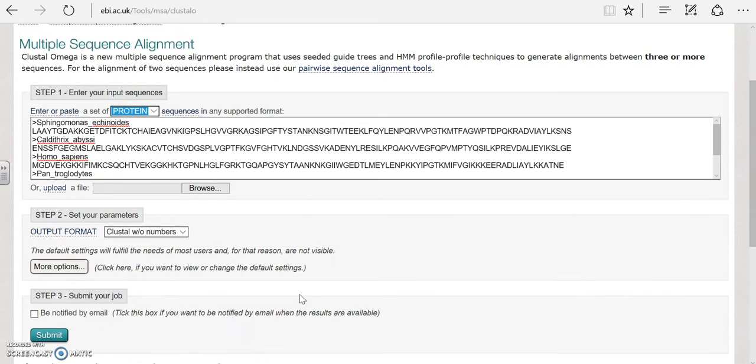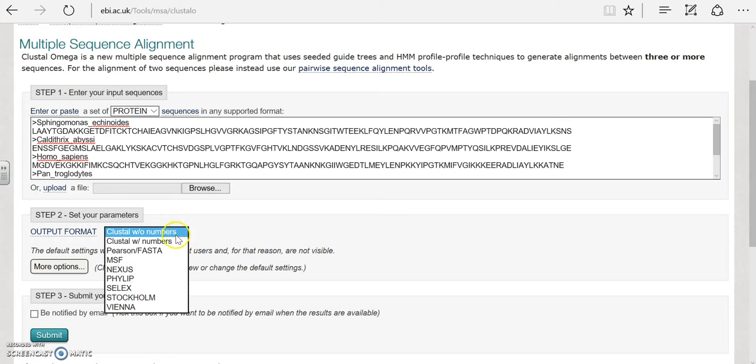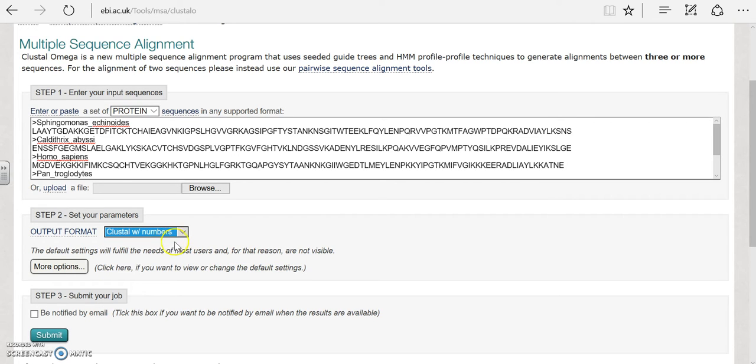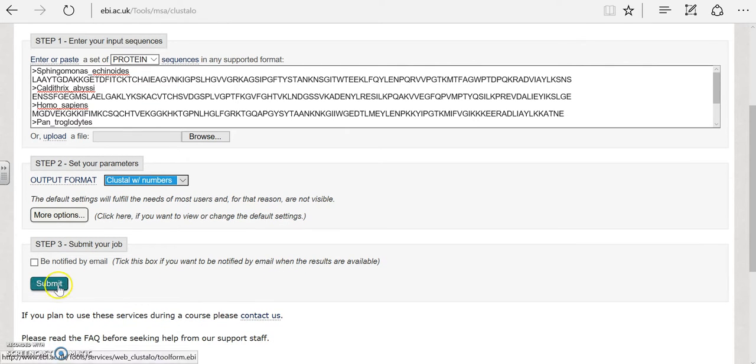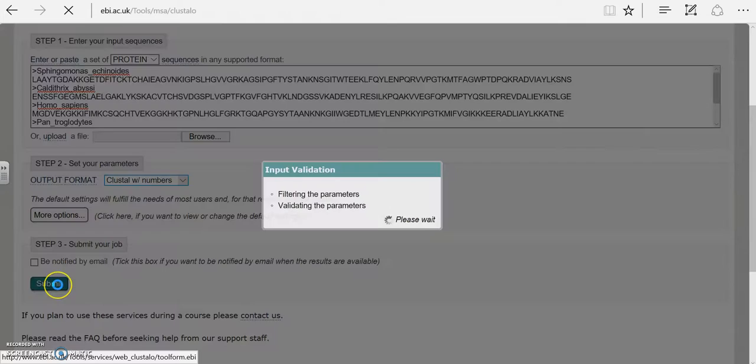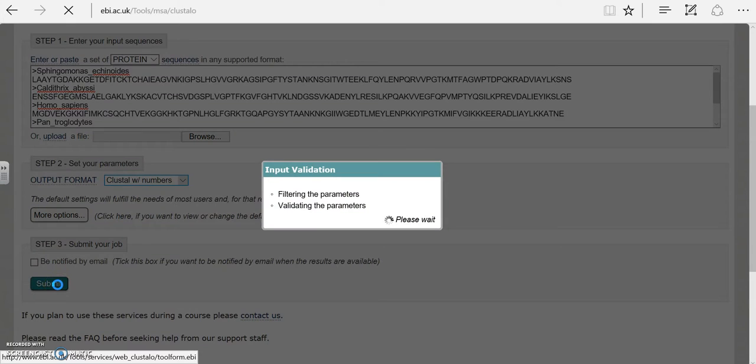In step two we are going to set our parameters and let's go ahead and choose Clustal with numbers that will actually number our amino acids which will make for an easier comparison. Now we're ready for step three to submit our job.